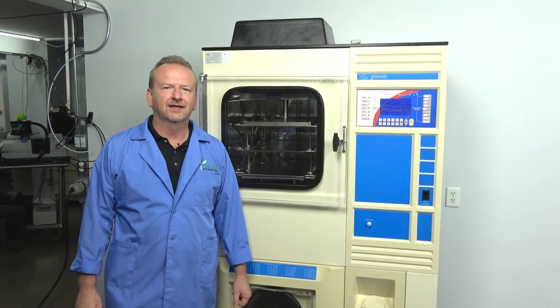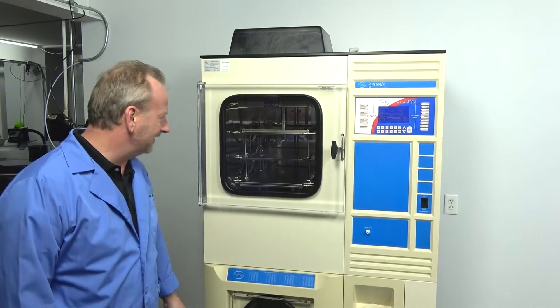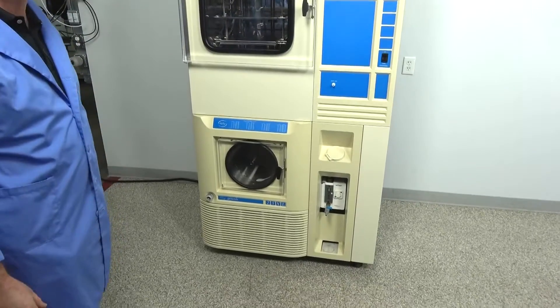Hi, I'm Richard from New Life Scientific, and today I have this Virtus Genesis 25XL. I'm going to go over a little bit of the features it has and what makes it different because it's the XL model.